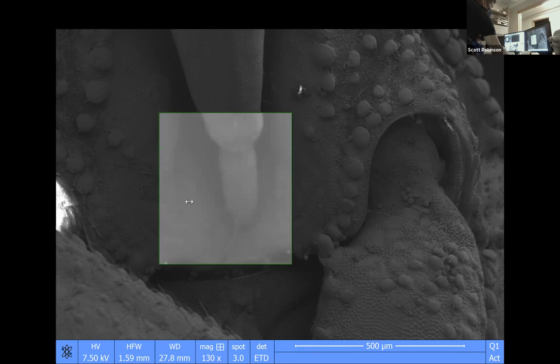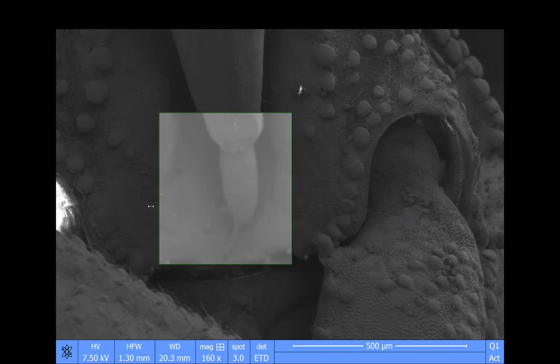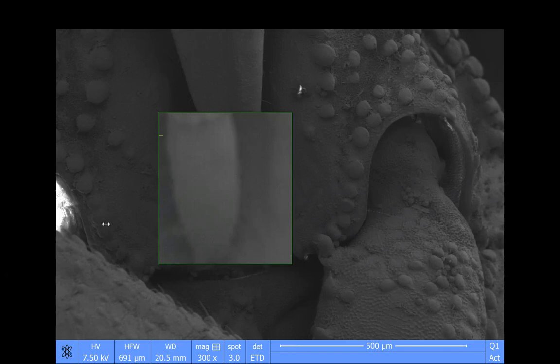So you can see that I messed up the contrast and brightness. So we can fix that. We can change it like this, make it brighter and darker. And then we can bring the mag up. Oh, look at that, I think that's some sensory hairs on the rostrum. Yeah, that's not surprising.